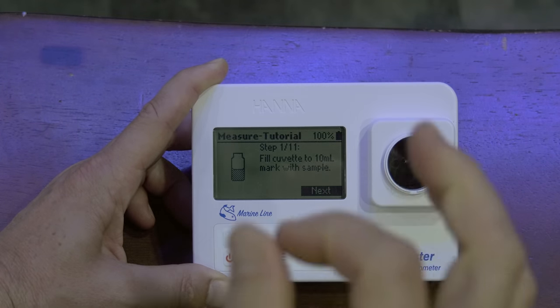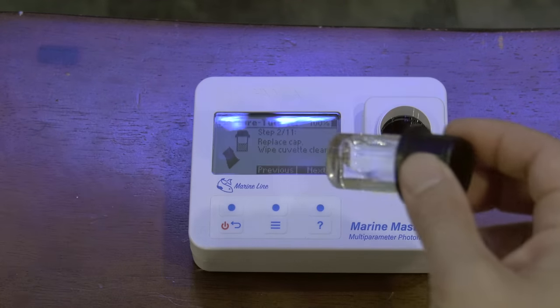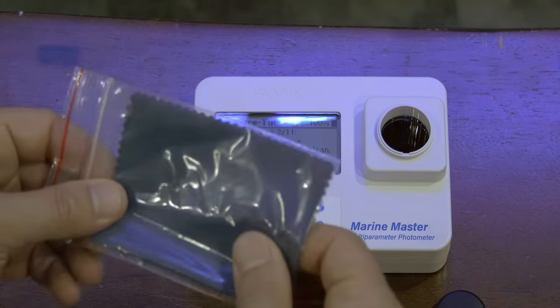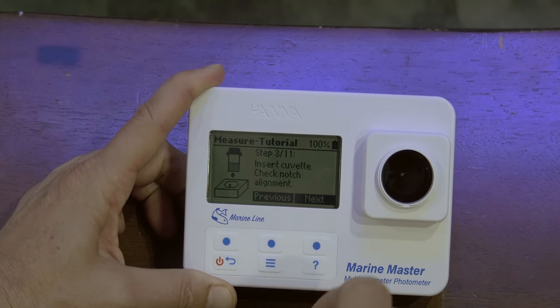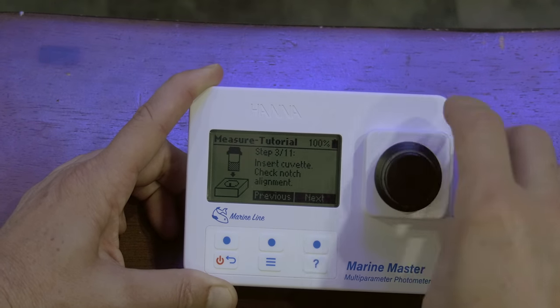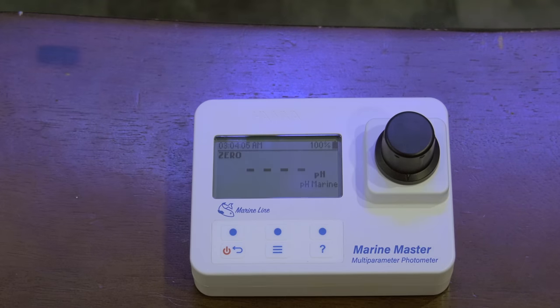Fill a cuvette to the 10 milliliter mark with sample. I'm going to go get 10 mils out of my tank. Got my 10 mils. Next. Replace cap. Wipe cuvette clean — usually I just wipe this with my shirt or a towel. They give you a cloth in the kit if you want to use it. Next. Insert cuvette, check notch alignment. There's a notch here and a little notch on the cap — line those up, it locks in. So I know it's lined up because it can't move. Next — it's going to zero it. I'm going to lay this flat so it gets a good zero.